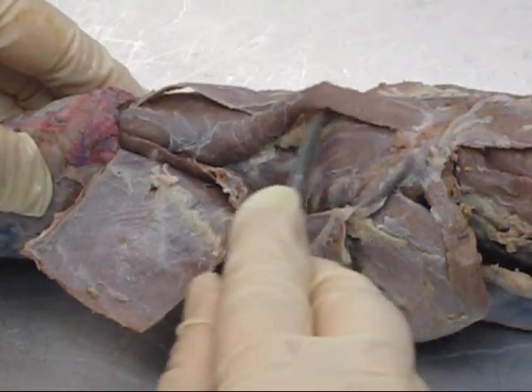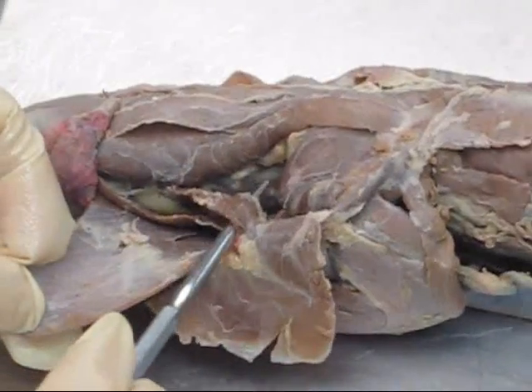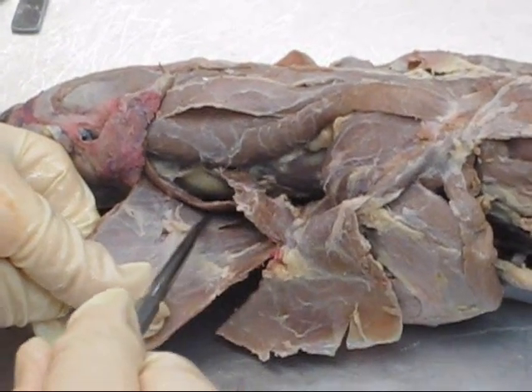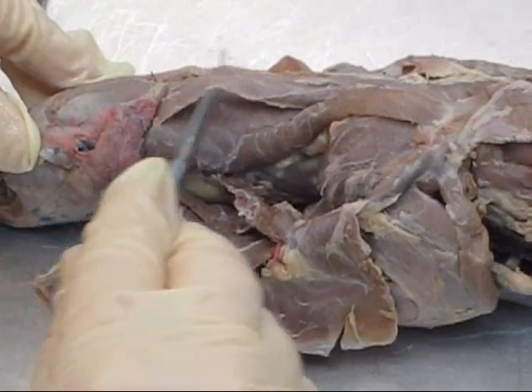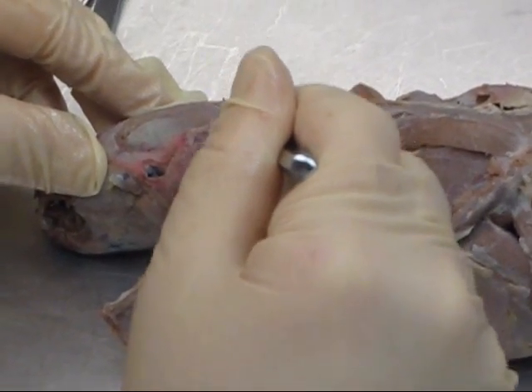Also called occipitoscapularis. The next muscle is atlantoscapularis. Going out to the mink's shoulder now, this muscle is levator scapulae, also called homocervicalis. And then down here, the deepest one was cleidomastoid. Also, just deep to our rhomboideus capitis, the muscle you can see on either side here is the splenius, or splenius capitis, as we would call it in humans.